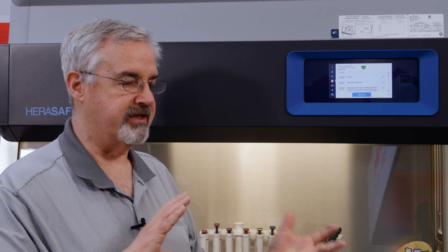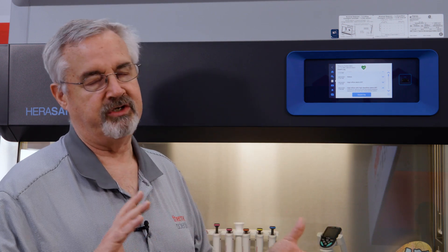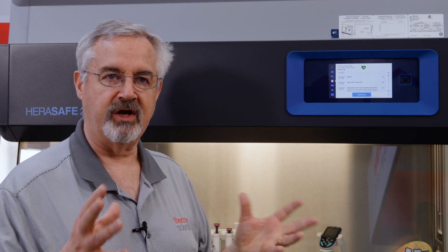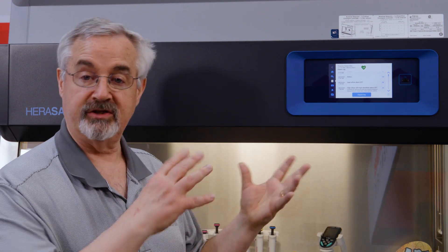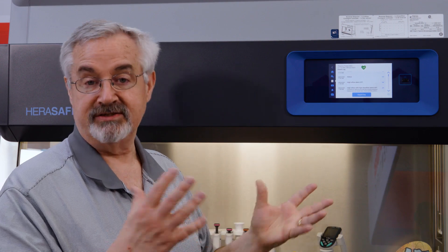The advantage of this is that if there's an incident or service incident with the unit and you call in the service engineer, trying to determine exactly what caused that alarm to go off, you can actually go back to the event log and see.